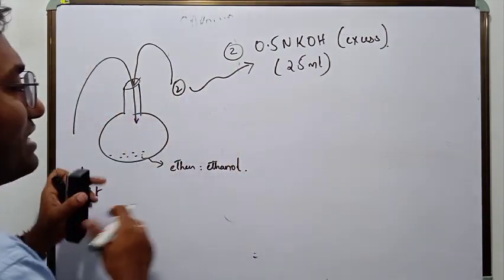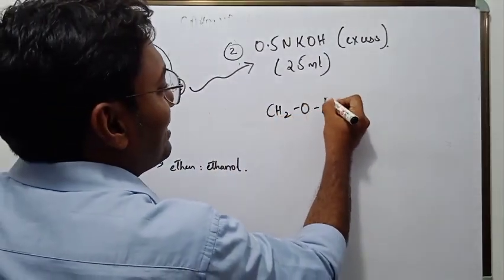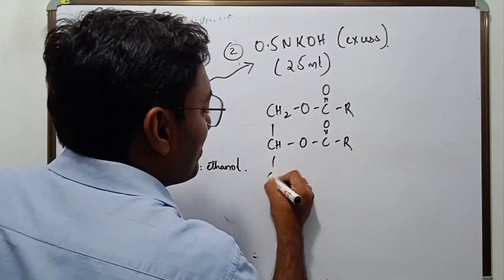So what will be the reaction? Here there will be a triglyceride molecule, right? And that would react. This is the triglyceride molecule.